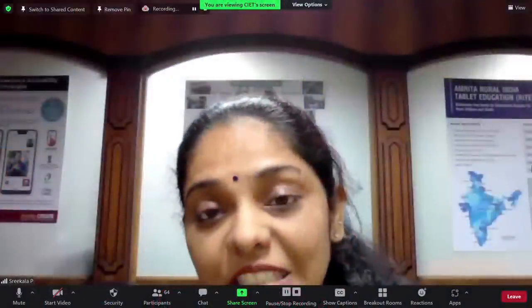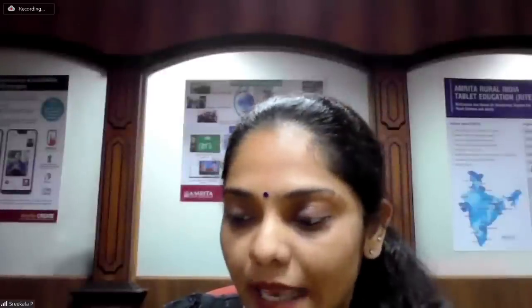So what is the goal of a teacher? To promote learning, the desire in children to learn the concept. And keeping this in mind, the virtual labs were created. Srikala has explained beautifully how to use the Diksha platform to access the virtual labs. I'll take you through the biology experiment of class 11.